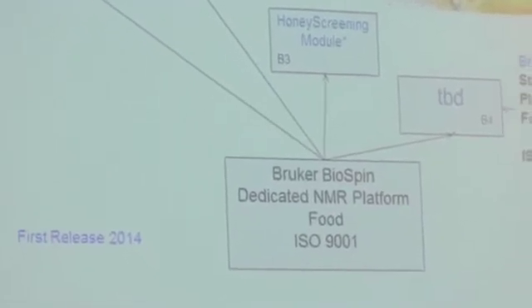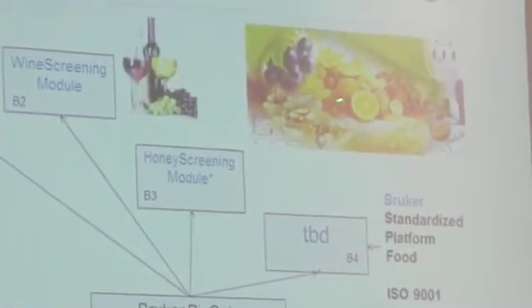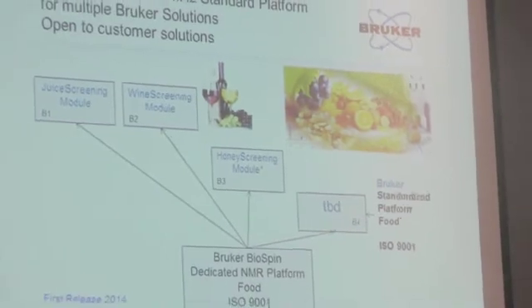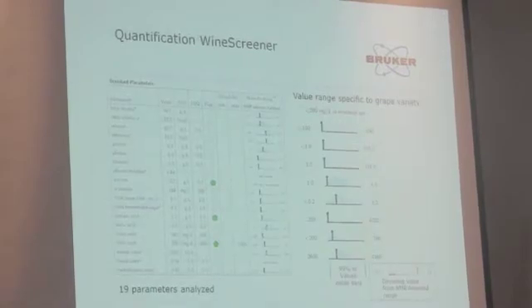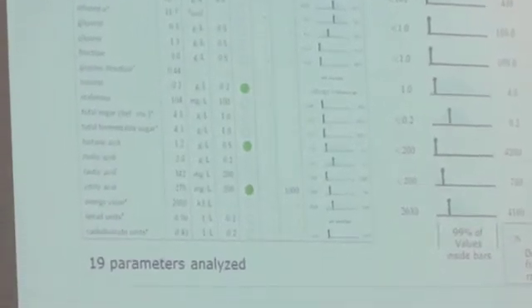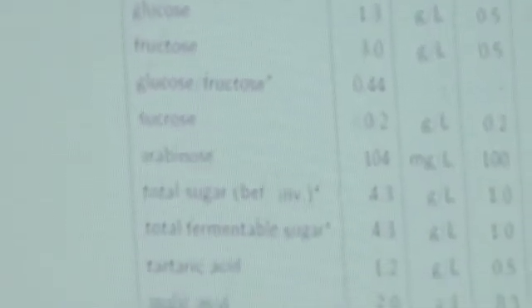But in wine, they're always worried about the label. So this technology is used to have the fingerprints of everybody's vintage. They can tell you the label, the vintage, is it from that part of France? And then they give you all this information, and these printouts with all the chemistry, and say this was a Riesling. They have a database of all the results of all the Rieslings, thousands of them, and it tells you where your chemistry lies in the distribution. I don't know what you do with that, but some people probably do.